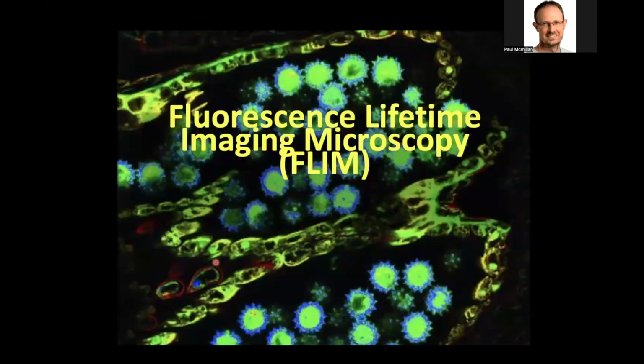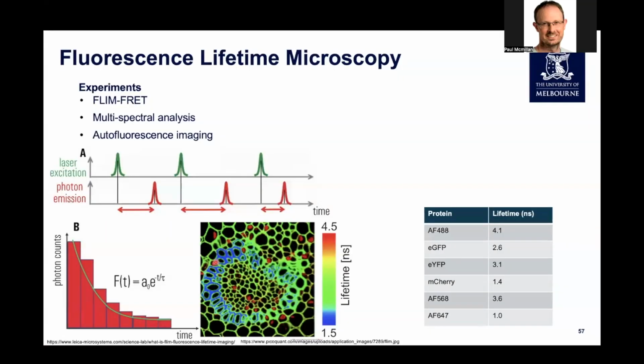So what I'll go through next is the fluorescence lifetime. If you remember, that's the length of time that the molecules will stay in that excited state, and that is very different for each of the molecules. For example, in this table on the right-hand side, if we have, say, Alexa Fluor 488 and enhanced GFP, spectrally those two would sit directly on top of each other, but they have very different lifetimes. Alexa Fluor 488's lifetime is about 4.1 nanoseconds, GFP is 2.6, so we can use that to separate those out.